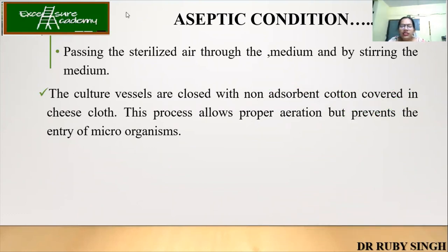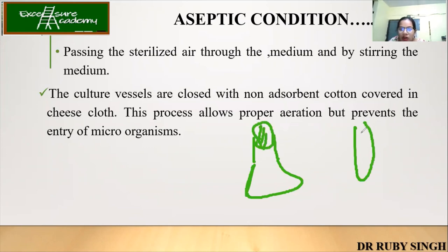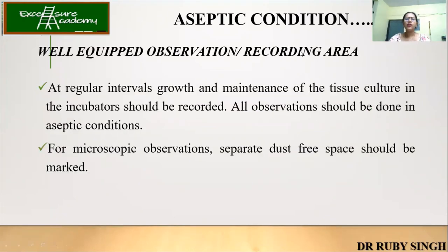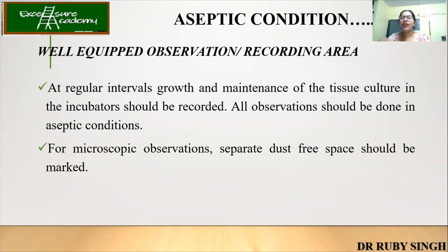Culture vessels such as conical flasks or test tubes are plugged with non-absorbent cotton plugs, and on top you have muslin cheesecloth covering, all required to prevent entry of microorganisms. You also need an observation and recording area with a microscope, because from the naked eye it is not always possible to see contamination. Under the microscope you can check whether any contamination or unnecessary growth is happening, and that can be recorded and observed. The area should be dust-free, as dust might be confused with microbes.